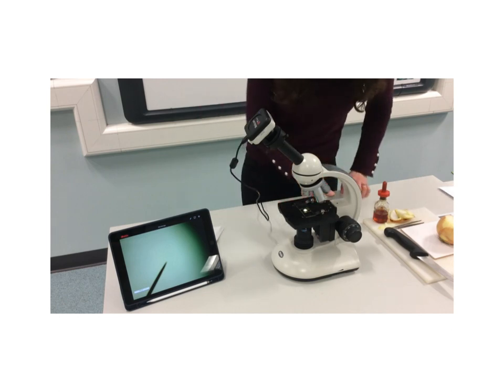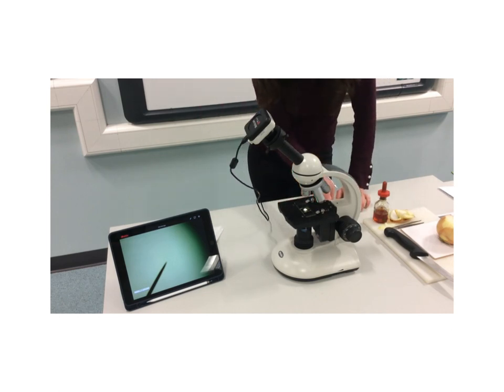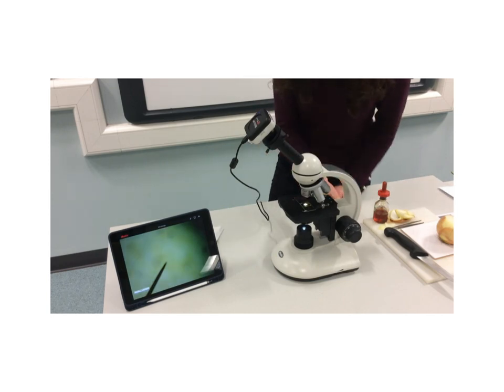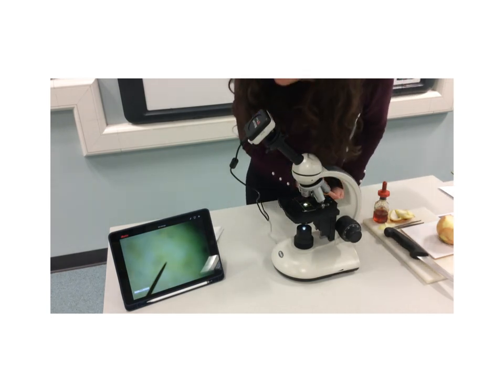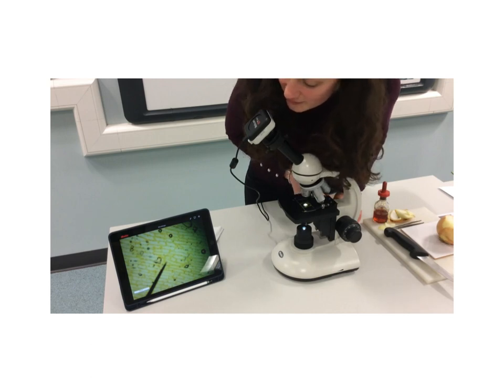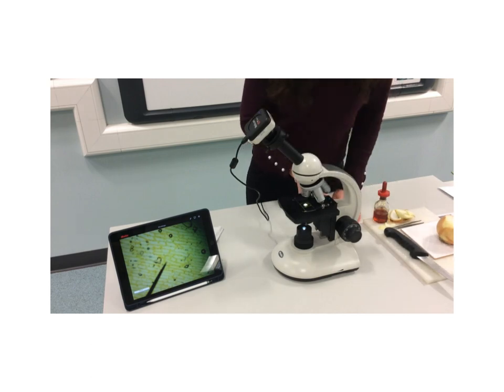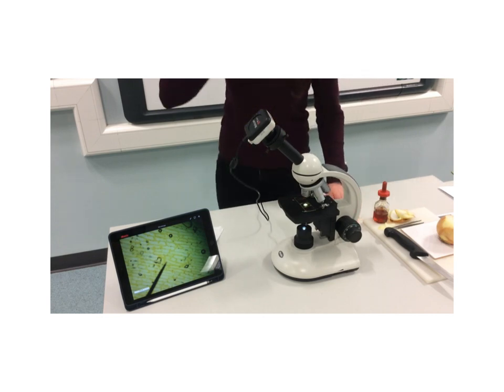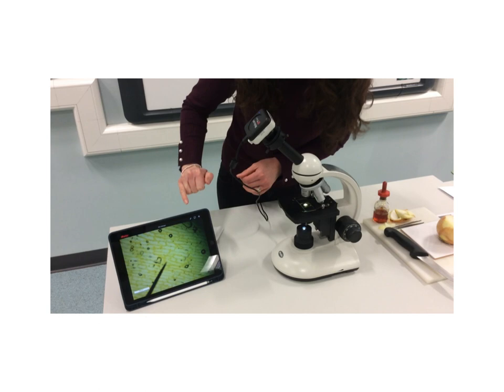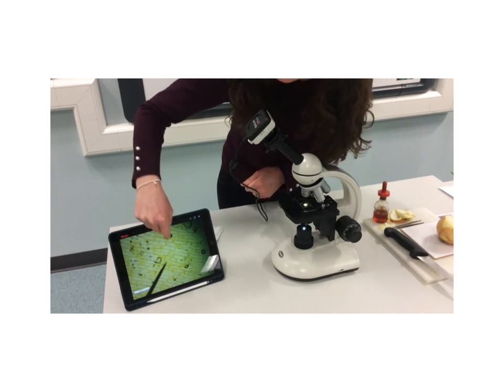Okay. So I've got to use my coarse focusing knob to get my image in. I'm going to minimise the distance just in case that was to make any contact, and then I'm going to focus away. So hopefully now you can see our onion cells come into image. So that is what the cell of an onion looks like, and in a later lesson we'll spend a wee bit of time looking at the different parts of the cell, but hopefully you can see these outlines.